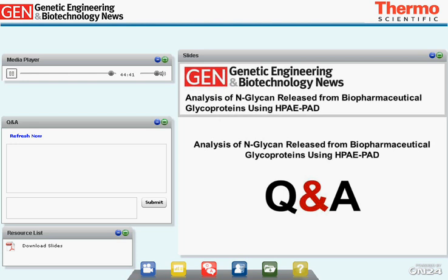And another question, Sebastian, why don't you analyze the N-glycans via mass spec? Mass spec? Okay, we also have a lot of mass spec instruments here, so we also analyze them via mass spec. As I said, we are using complementary methods for reliable assignments of glycan structures.